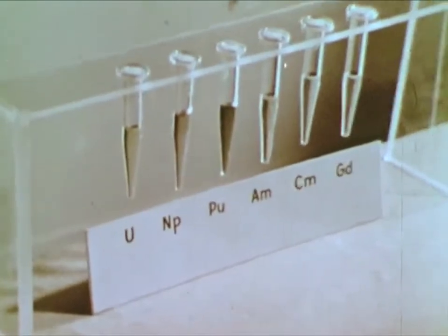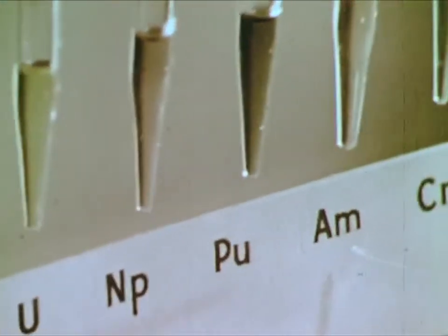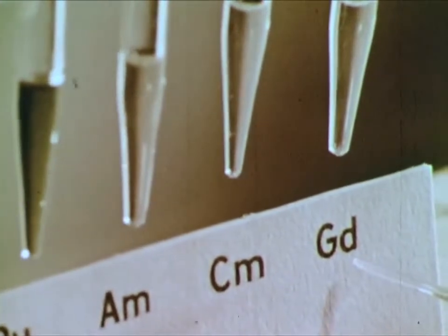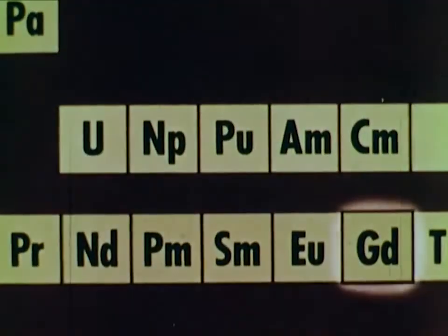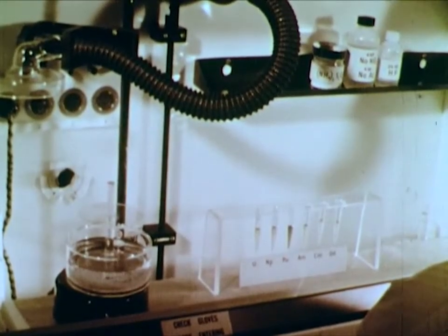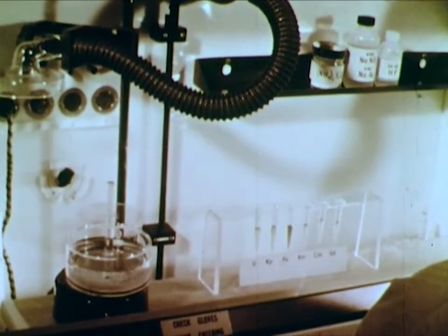Here are ionic solutions of the nitrates of uranium, neptunium, plutonium, americium, and curium. And here is a solution of gadolinium nitrate. Gadolinium is one of the lanthanide, or rare earth elements. As you know, the transuranium elements are radioactive. The particular isotopes that we are using emit helium ions called alpha particles. However, since alpha particles can be stopped by ordinary glass, we can perform our experiments safely in a glove box.